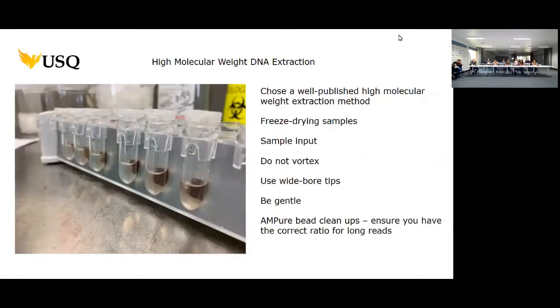So, high molecular weight DNA extraction. I won't hang on this one too much because which extraction you choose is really dependent on your sample, but please choose a well-published high molecular weight extraction method. You want to make sure that you're not going to shear your DNA through the process, so make sure you get this one right.